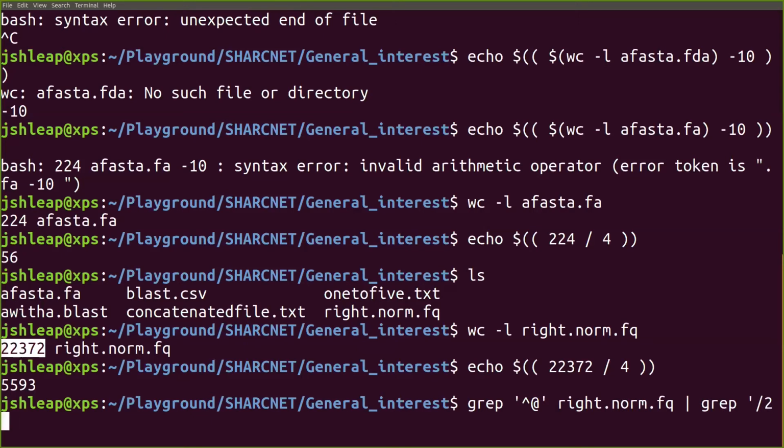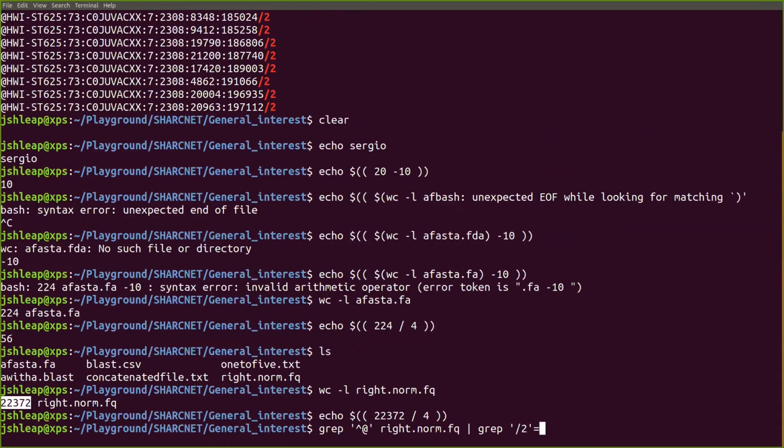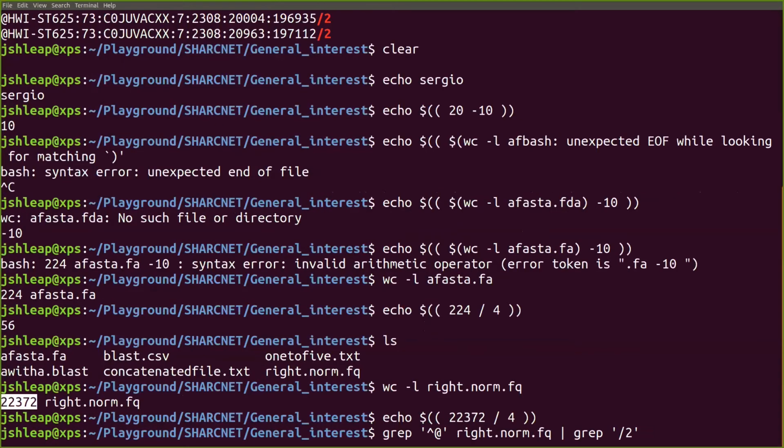So we have this one, that we think is fine. I'm going to make it a little bit smaller so you see it in just one line.